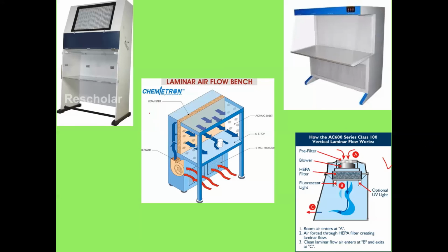I always prefer the horizontal laminar flow, where you have constant flow directly in front of your face. In the other case, when it is coming from the top and then turning around, I sometimes think that maybe there is not enough pressure or something like that. So I always buy or prefer these horizontal laminar flows. There are different types of laminar flow: one very small size, one very big size. With the biggest size, 3 people can work together, but it is not allowed to have more than 2 people. So the size depends on that.